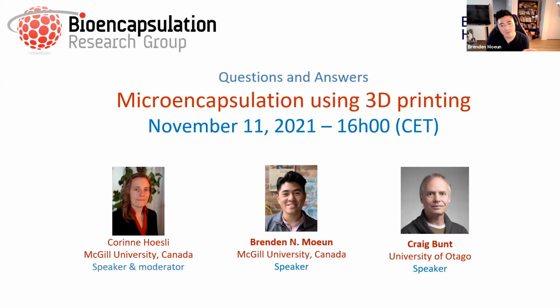In order to get something like that, we don't really do a lot of that work, but this would just be an off the top suggestion. If you are trying to position items such as cells radially, you can use a coaxial nozzle, which has been my answer to a couple questions in the Q&A.